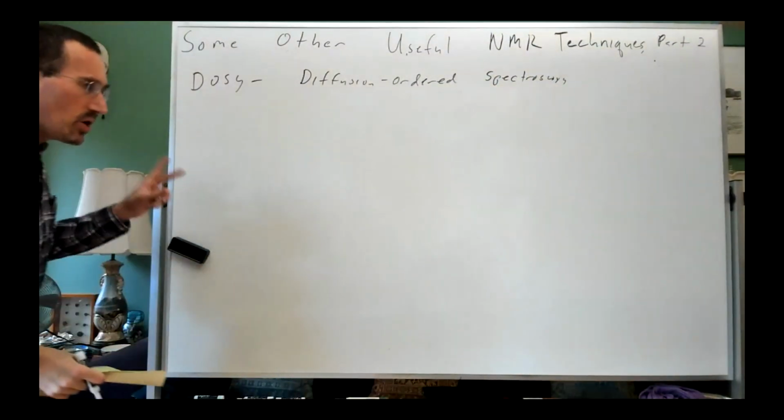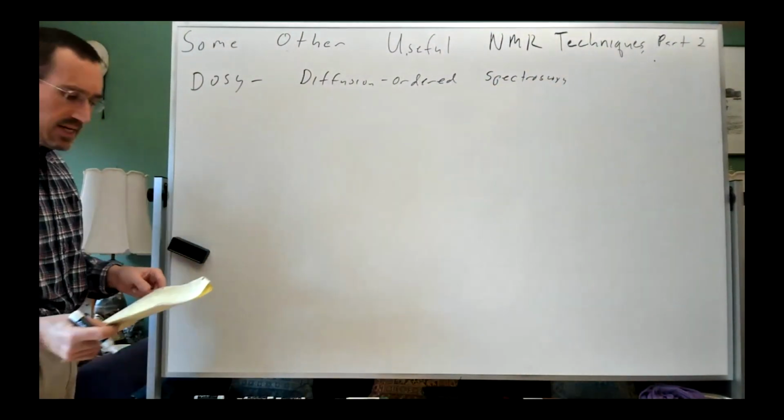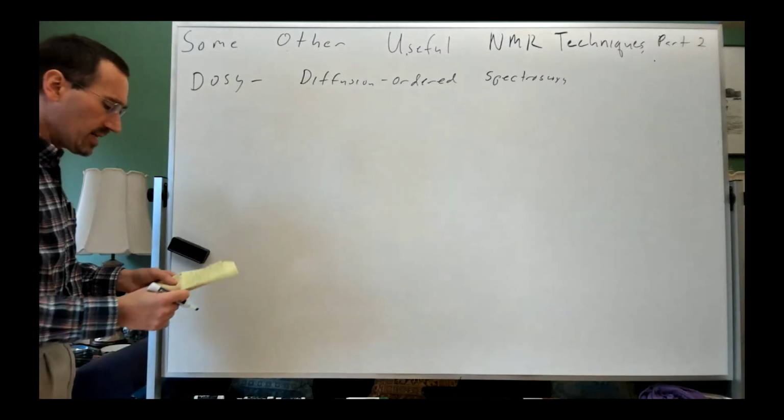What DOSY is useful for, it's a 2D technique, or sort of a pseudo 2D technique.